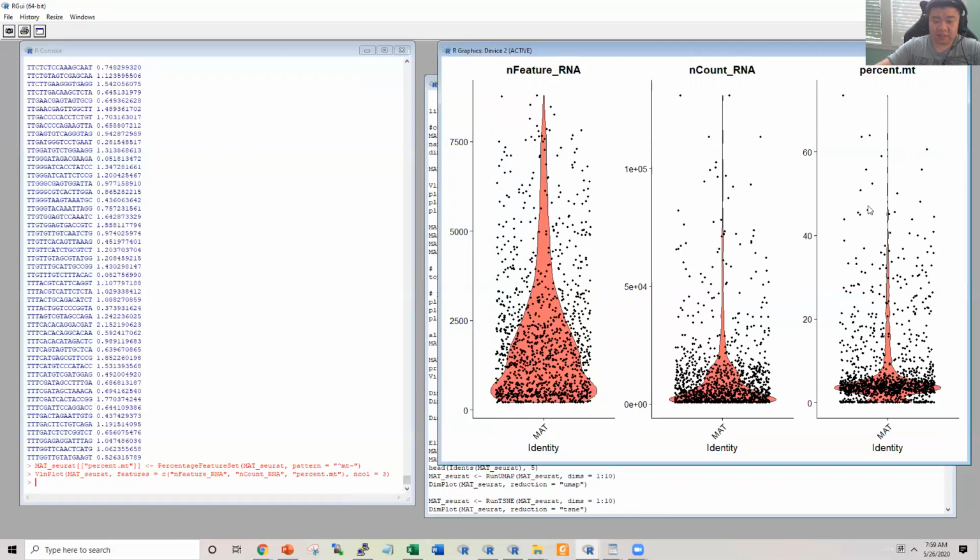And here is the percentage of mitochondrial genes. Normally, we consider 10% or less as a cutoff. This has been reported before in a Genome Biology paper. In single cell data analysis, if the cells are leaking, the cytosol part will be leaked, and the mitochondrial part can still be there. So the percentage of mitochondria encoded DNA expression will be increased in these leaking cells. So normally we use this as a threshold or feature to filter out the low quality cells.